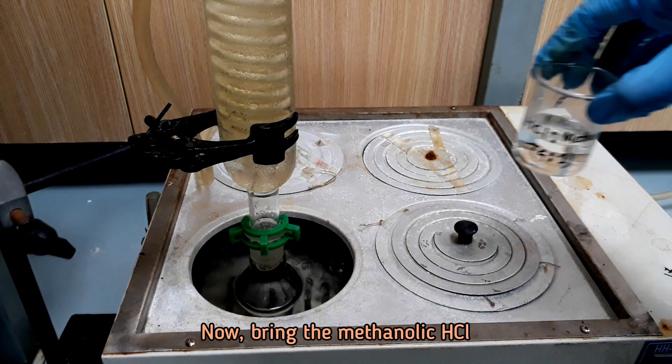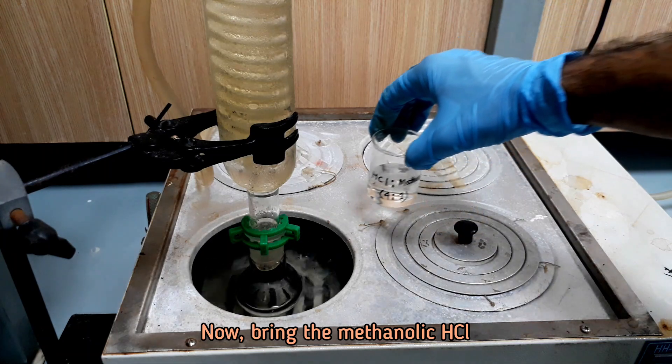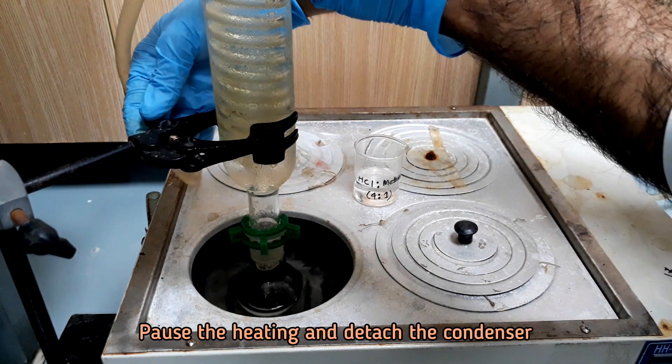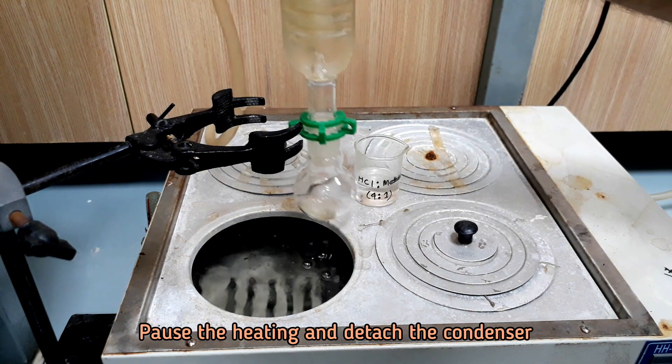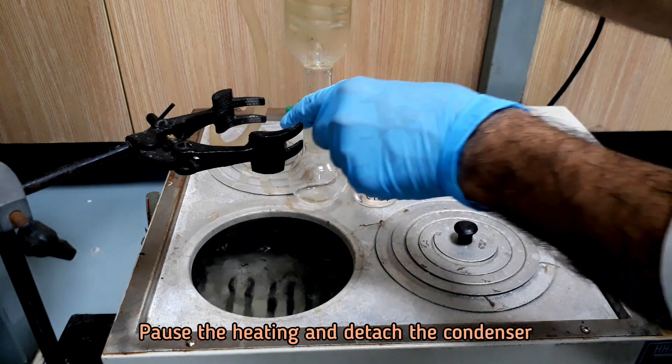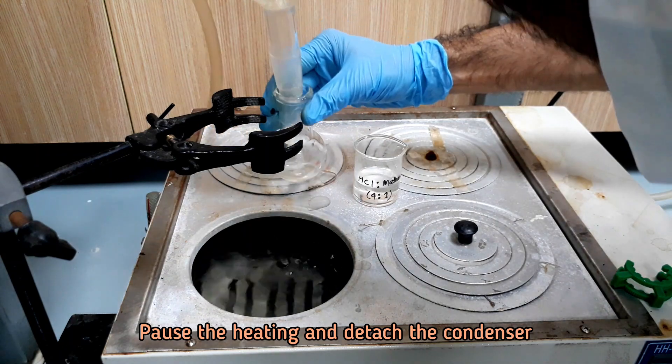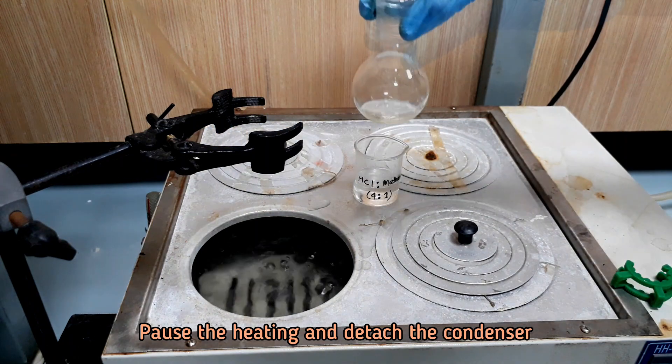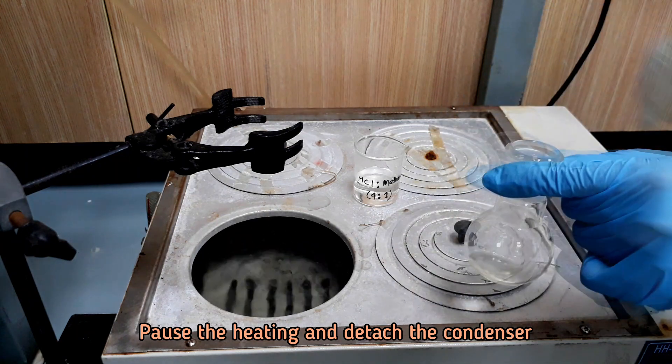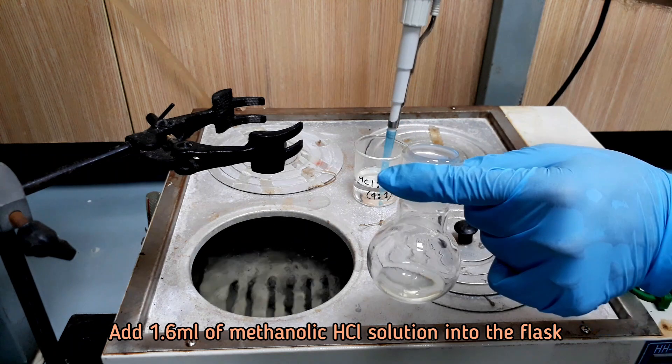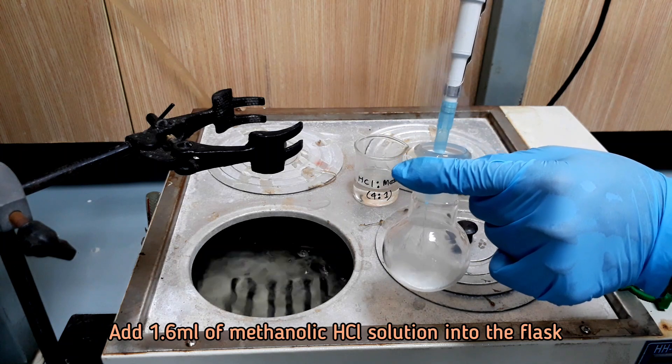After 15 minutes of boiling, bring the methanolic hydrochloric acid solution. Add 1.6 ml methanolic hydrochloric acid solution into the flask and continue boiling for another 25 minutes.